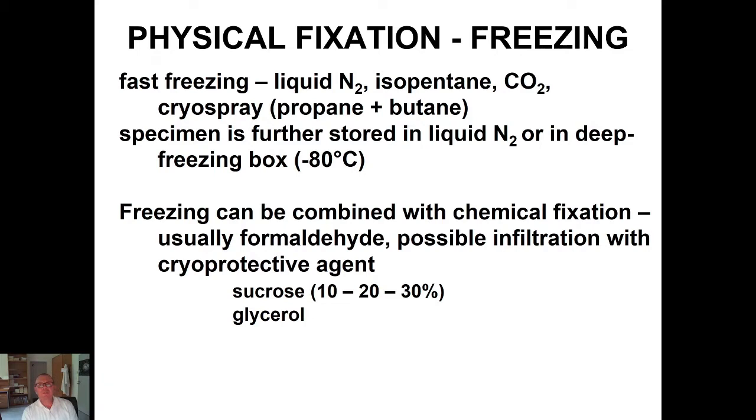Something about freezing. Freezing, as I already said, has to be very fast and deep, so liquid nitrogen or other chemicals are used. Then the tissue also has to be stored at a very low temperature. Special containers with liquid nitrogen can be used for the storage.